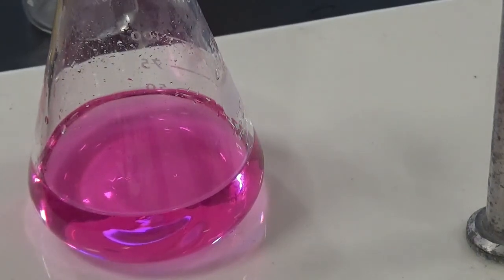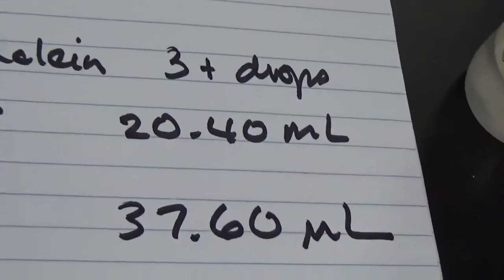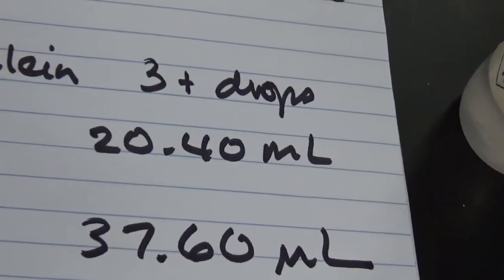Okay. So going over here, I have my molarity of the NaOH there. I have my initial volume, which you missed because it was on standby, and the final volume. And on the previous page, I have my volumes of both layers, and I'm done with this experiment.